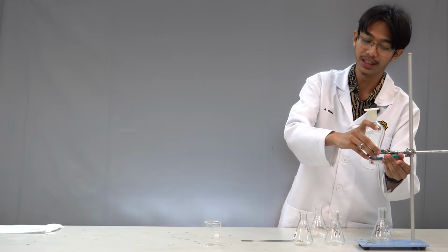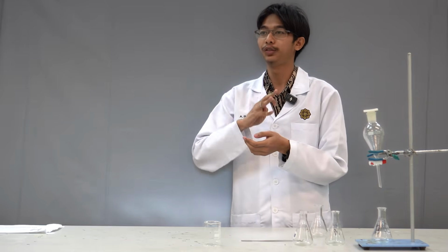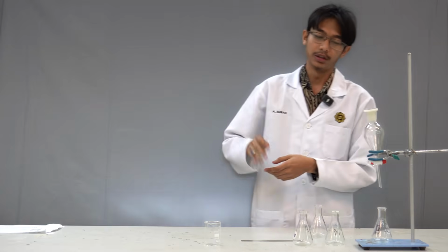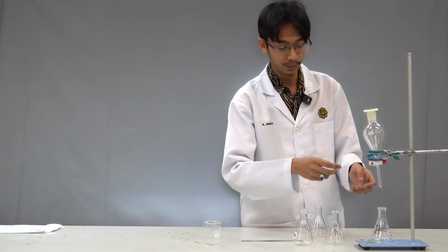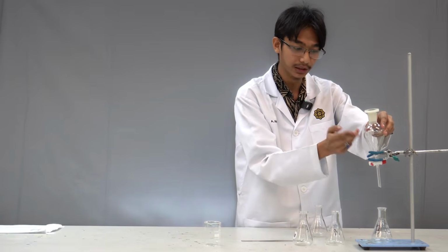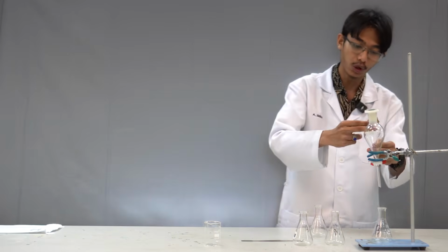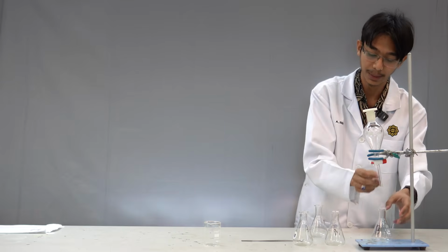As you all know, density on a comparative scale of specific gravity, water, let's just approximate it to 1 specific gravity, right? So if water is 1 specific gravity, then DCM is going to be 1.33 SG. When there are 2 layers, the layer at the bottom will usually be the denser layer, the heavier layer, that has more mass per unit volume. And the top layer will be the less dense layer. So basically, you're going to have the DCM mixture at the bottom.